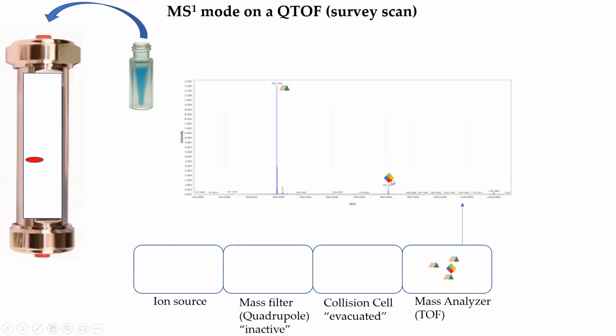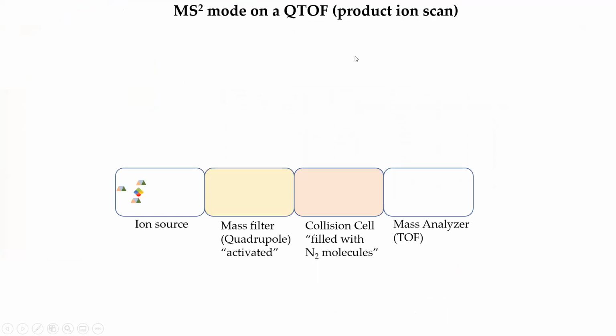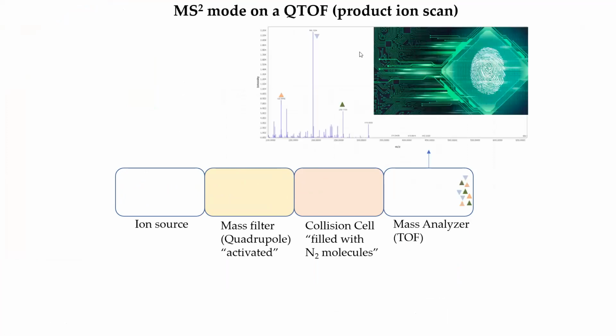And then each ion basically will provide a distinct mass signal. And then in MS2 mode, so tandem mass spectrometry, it's made up of normal mass spectrometry at MS1 level, which we call a survey scan. And then of each of these ions, we want to fragment them to get something like a fingerprint. And how that works is shown on this slide, for example. So we have in our ion source, continuously we create still the same ions. And then in the mass spectrometer, they're filtered to only let one type of ion through. Those ions get broken up, make fragments, and we get a fragmentation spectrum.